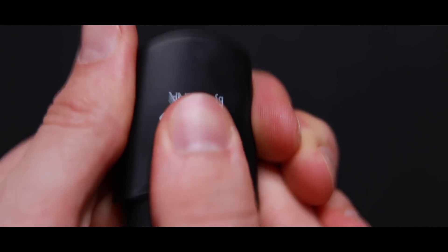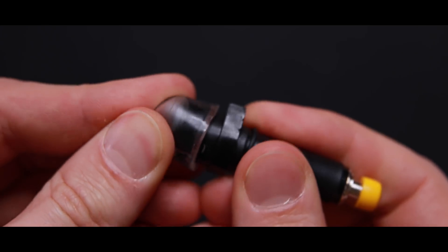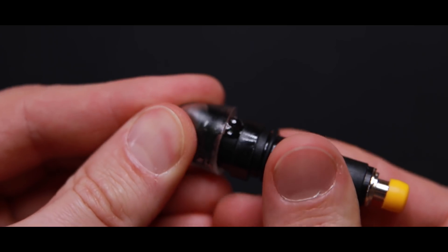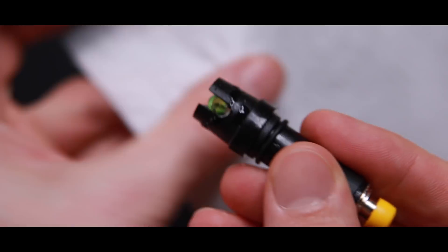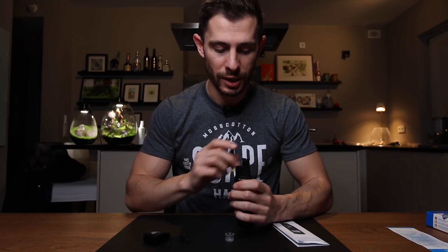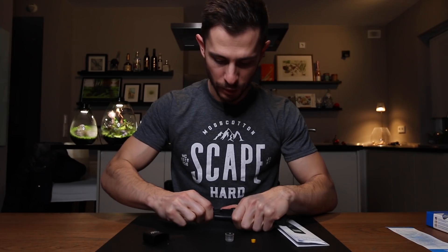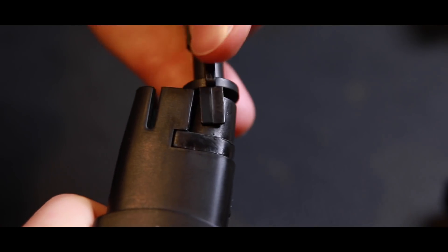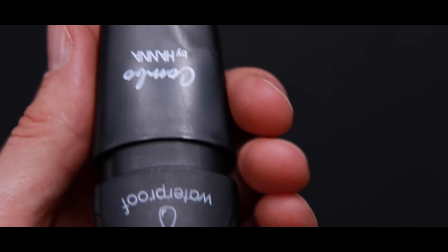First things first, we have to insert the pH electrode. To do so, we open up the device at the bottom. The electrode comes with a little liquid at the top — this is the storage solution. We're going to open this and wash off any salt or remaining storage solution from the tip of the electrode. Now let's insert the electrode into the device — we just plug it in, press a little bit and then turn it inside. Now it is inside and it's protected by this cap. Fully assembled.